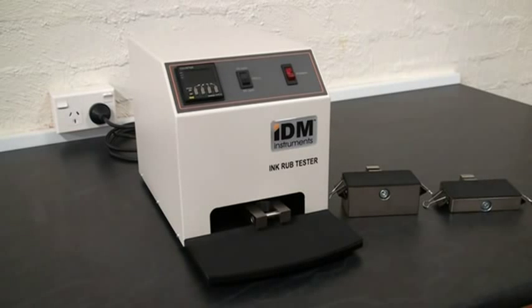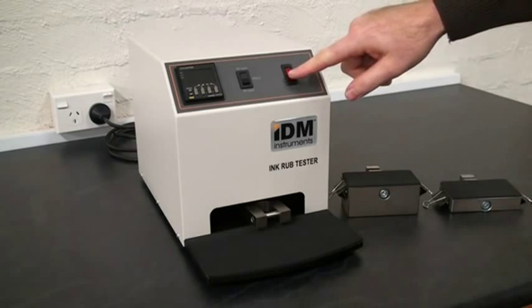Welcome to the IDM Ink Rub Tester. To turn it on, we switch on the power switch.